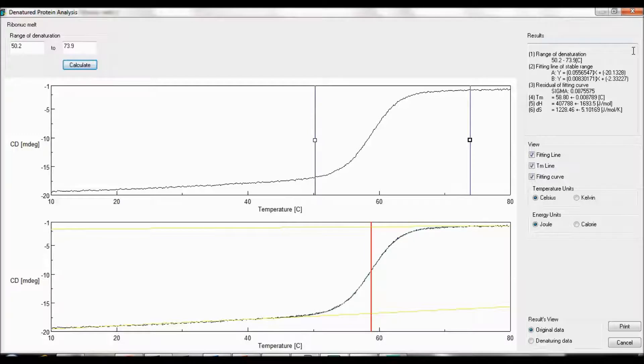The results of the denatured protein analysis are shown to the right. The range of denaturation are the temperatures specified earlier. The fitting line of the stable range are the parameters for the approximation curve where the CD values change linearly.